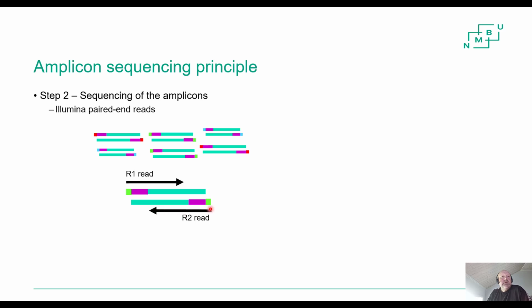And now we can do demultiplexing, because the reads will carry with them this barcode signal, right? And the primers are the same for all reads, regardless of where they come from. So that's easy to recognize. But we are actually interested in this part here. And notice now the amplicons are typically so short that the reads overlap each other. We get a part here which is sequenced twice. This is not strictly necessary, but this is what typically is done.